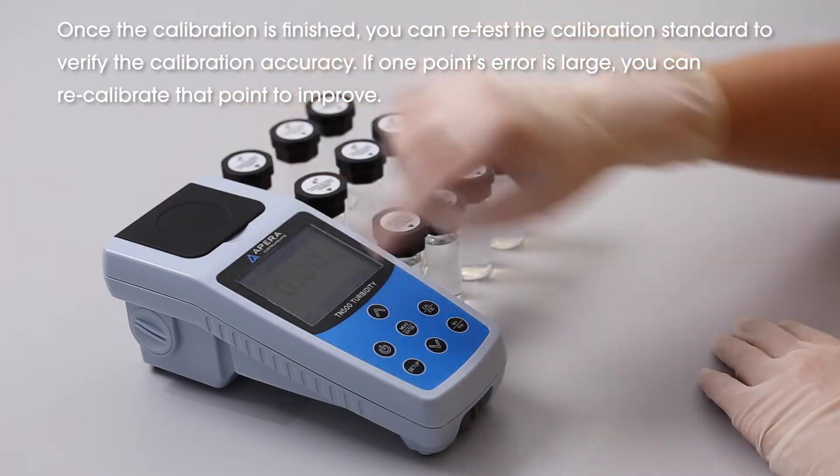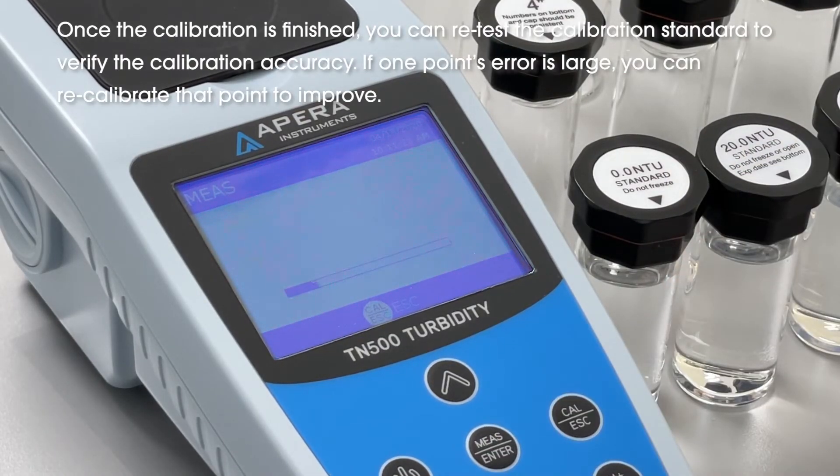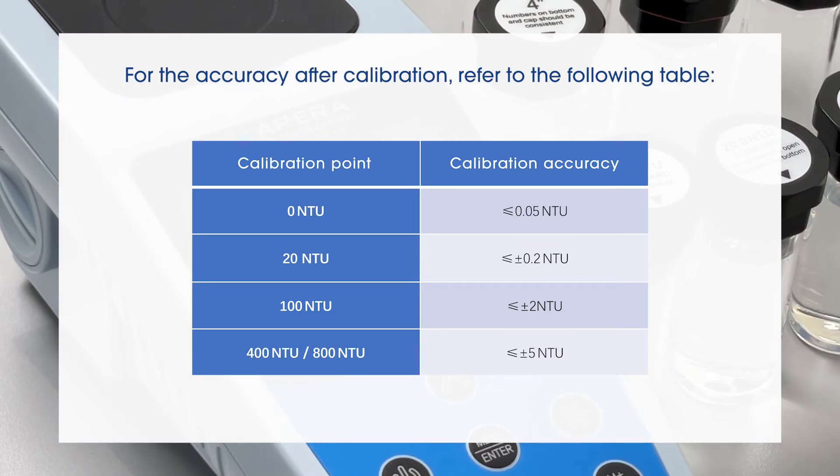Once the calibration is finished, you can retest the calibration standard to verify the calibration accuracy. If one point's error is large, you can recalibrate that point to improve. For the accuracy after calibration, refer to the following table.